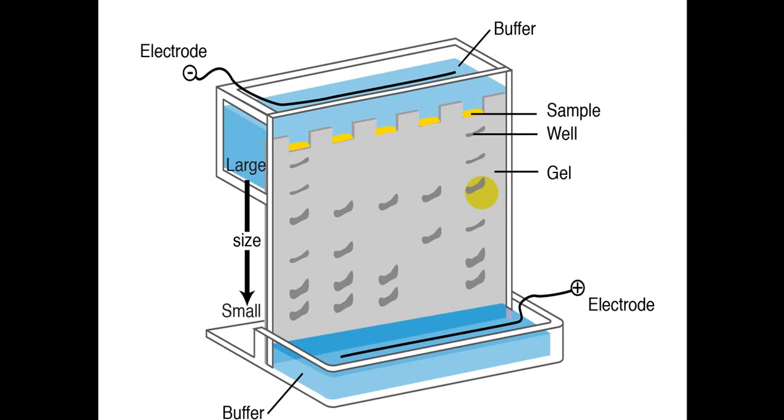So, like I earlier explained, this gel has been cast in a vertical fashion. Under normal circumstances, this gel is supposed to lie down, but it's not lying.